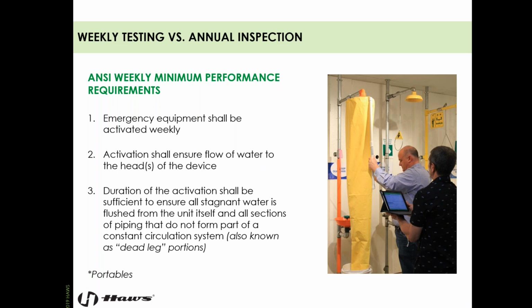Now, on a weekly basis for portable equipment, activation is not required. If it's a self-contained piece of equipment, like a tank, and it's gravity fed, then you just need to open the tank and make sure there's enough water in there for a full 15 minutes. Most manufacturers include a line that you can check. Water has to be above that line and you're good to go.